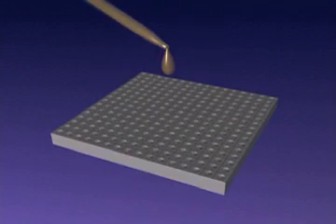The combined sample of fluorescently labeled cDNA is applied to the microarray chip.